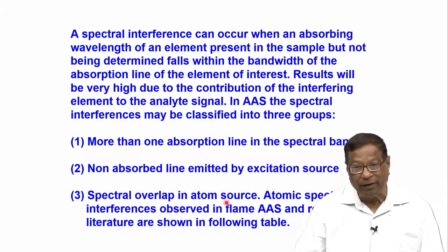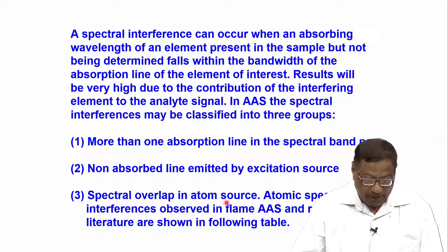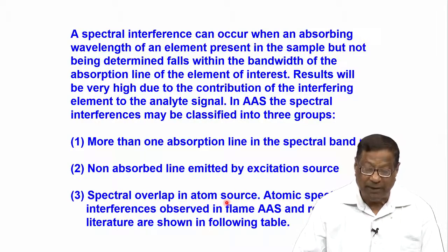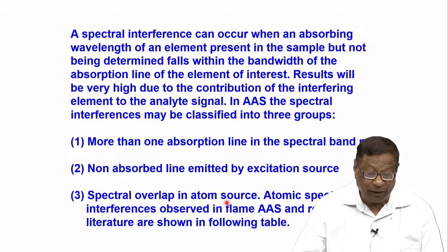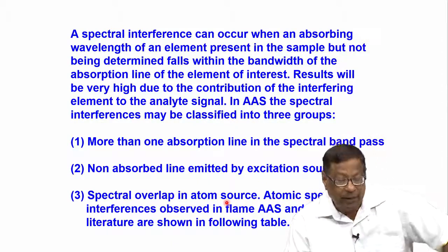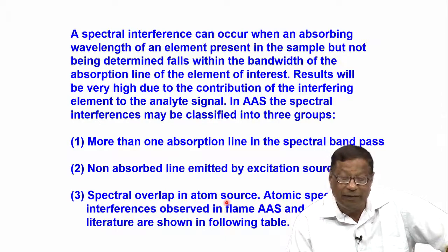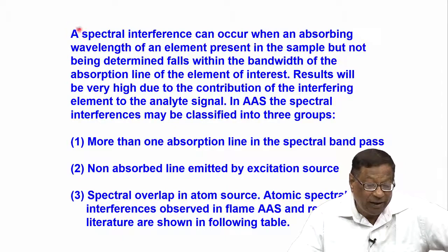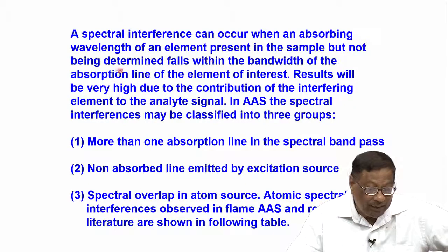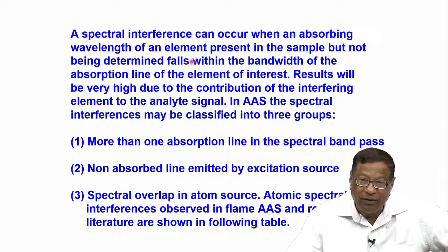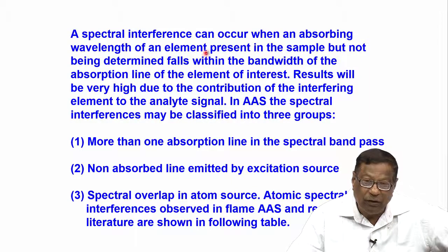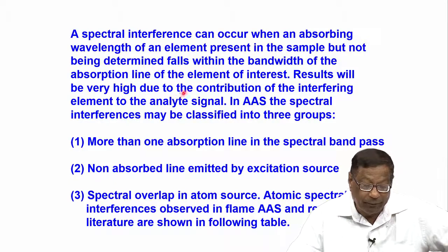Spectral interference can occur when an absorbing wavelength of an element present in the sample but not being determined has its resonance line falling within the bandwidth of the absorption line of the element of interest. This is the technical definition: the monochromator is unable to distinguish between the resonance lines of two different elements which fall within the bandwidth of the absorption line.